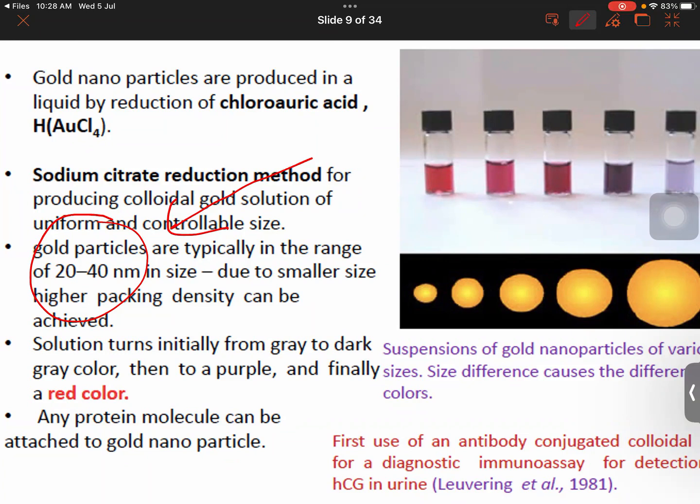So every time you have to test the stability of the gold nanoparticles, or nanoparticles that you have synthesized or you might buy from somewhere. This is very important. If not, then the possibility of failure to get a good result comes from here, the stability of the conjugates.